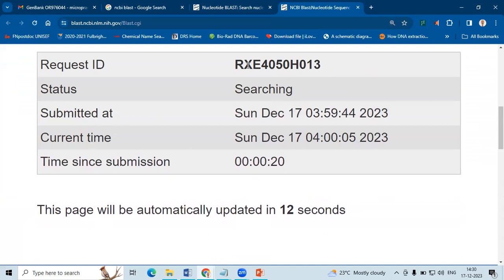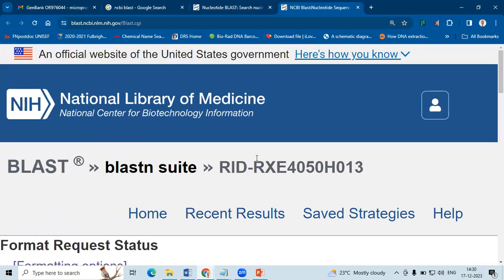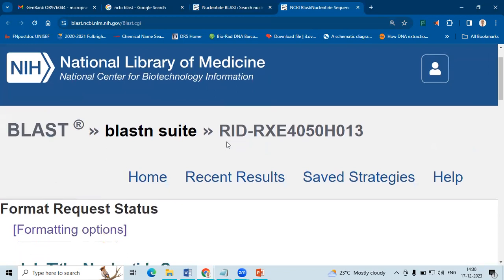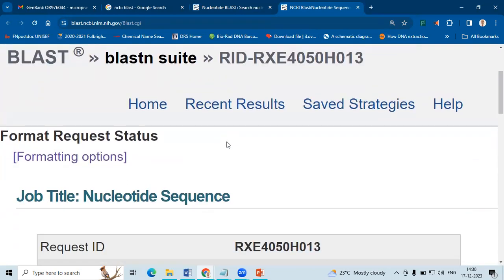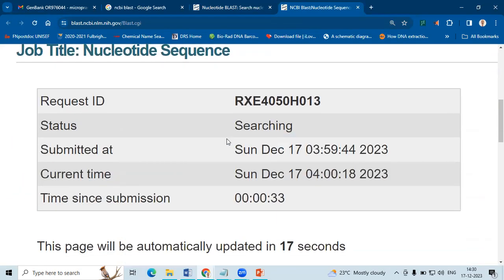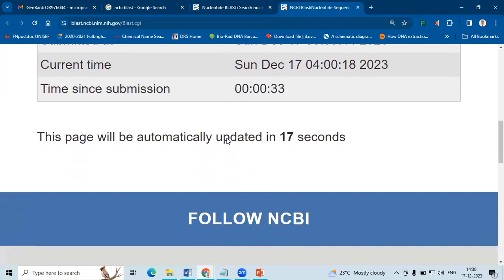Here you have a request ID, what is the time we made the request, what is the current time, how many seconds has passed since our submission. Usually this depends on the traffic in the server and also depends on the internet connection.